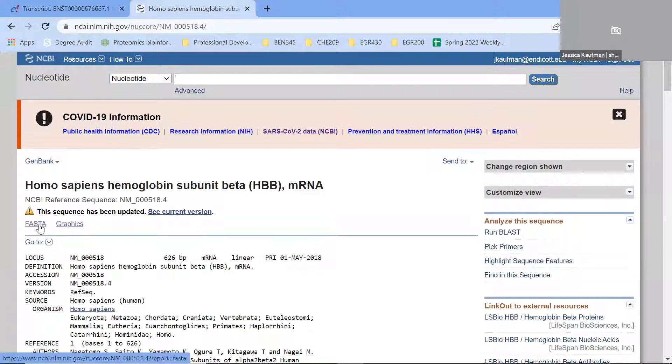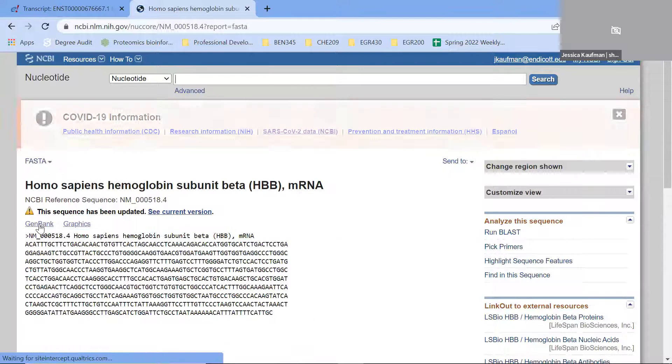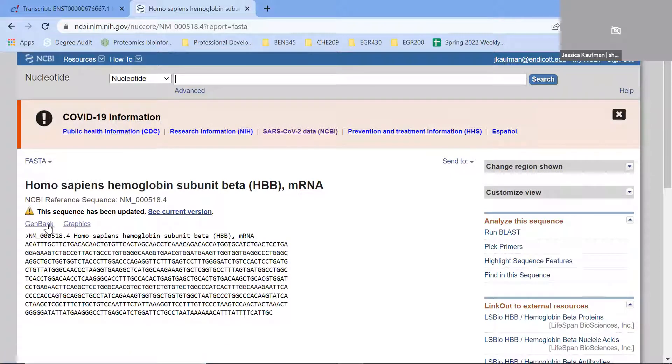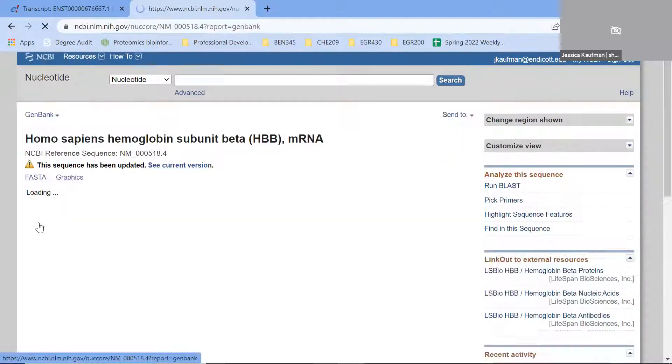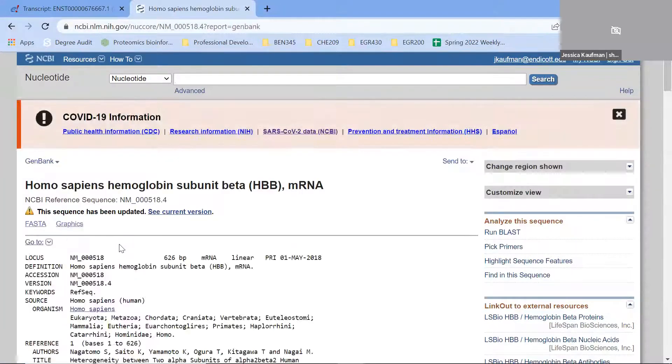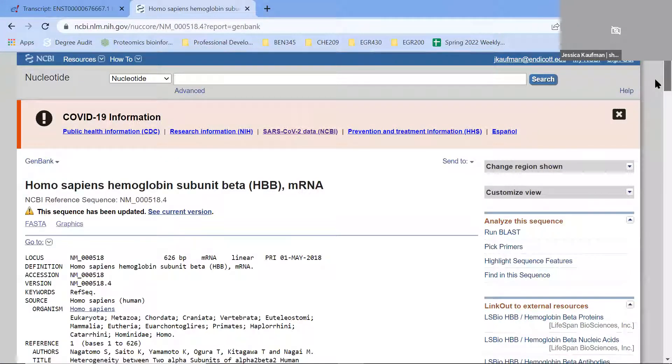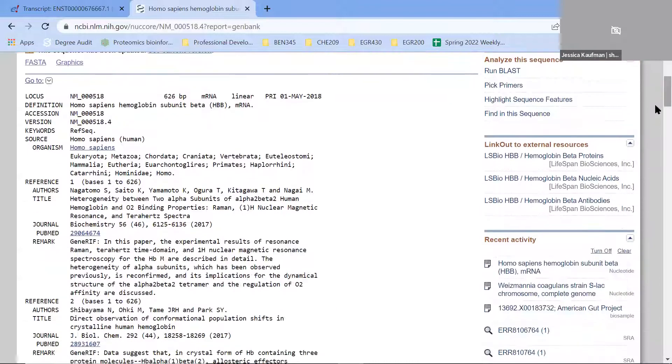We're not going to paste the FASTA sequence. We're going to look at the GenBank sequence. If I click on FASTA, you see it switches over to the FASTA view. If I click on GenBank, it goes back to something that looks more like an encyclopedia entry.